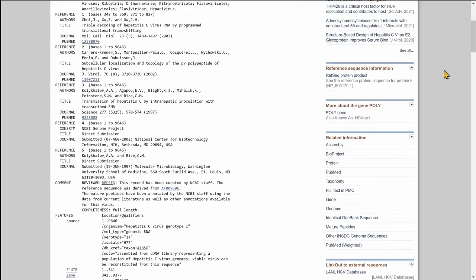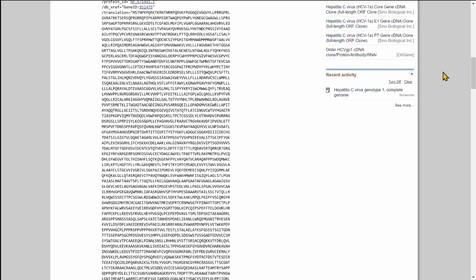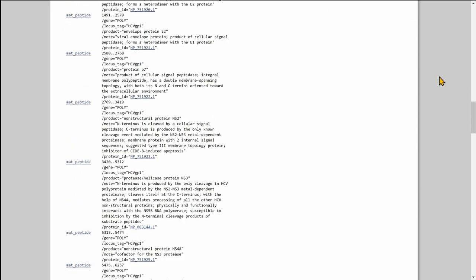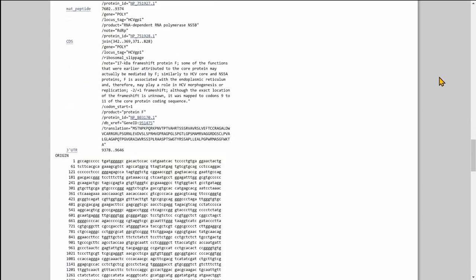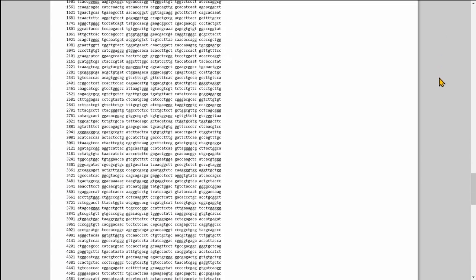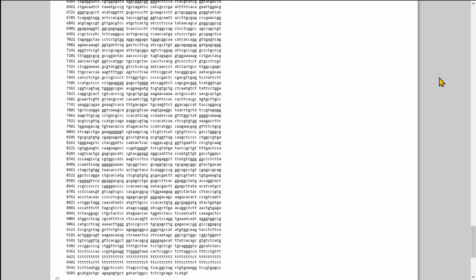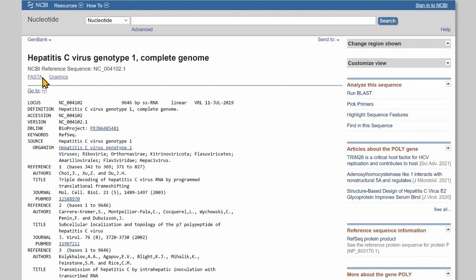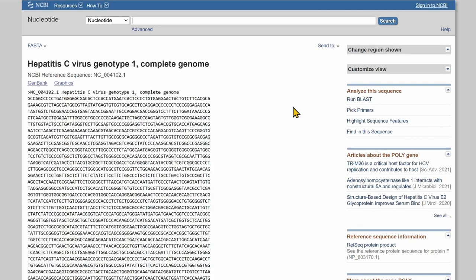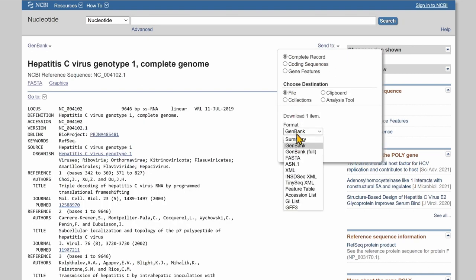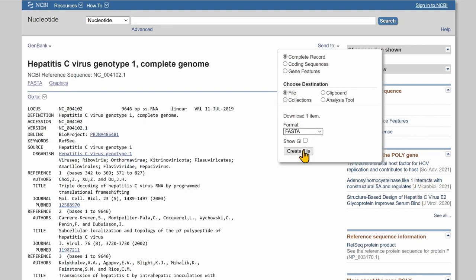Let's say you're sequencing hepatitis C virus. You go to the NCBI website and select the HCV genotype 1 reference sequence. By default, the sequence is shown in GenBank format, which provides a great deal of information about the sequence, including the start and end positions of genes and protein products. But we don't need that for aligning reads, and actually most mapping tools only accept FASTA files anyway. If you click on the FASTA link, the sequence is shown in FASTA format, but you might not want to do that for very large sequences. Instead, click on the send-to link on the right and select file under choose destination. From there, select FASTA and select a name for the file.